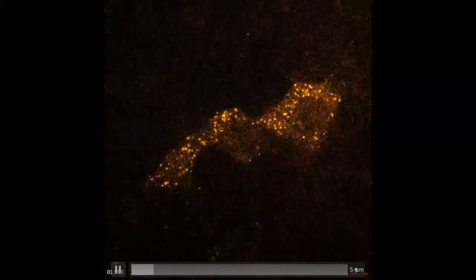And I'm just going to show you a video from cells that are expressing single molecules in fluorescence, and you can image them over, I think, 5 or 10 seconds. So this is something happening very fast in the cell. There is almost no bleaching in this kind of sample. Here it's 15 seconds.